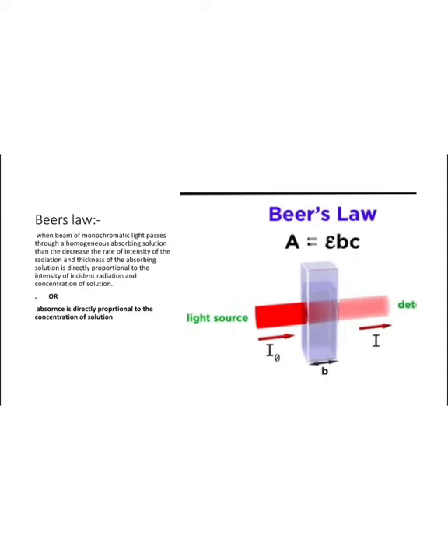When we pass incident monochromatic light through sample C, diesel, the diesel has a higher concentration than water and petrol. The monochromatic light absorbed by sample C, diesel, is 75%, because its concentration is more.